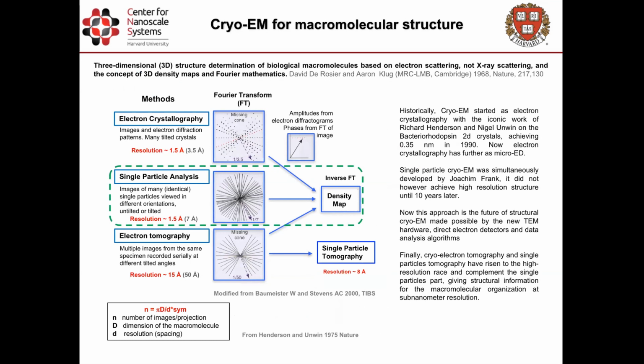Now, how Cryo-EM relates to macromolecular structure. It was defined in 1968 by David DeRosier, who is still Professor Emeritus at Brandeis, I believe, and Aaron Klug, who recently passed away, who was one of the directors of the MRC LMB founded by Max Perutz.